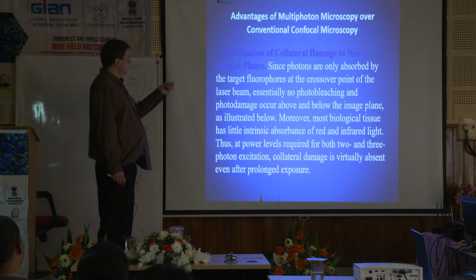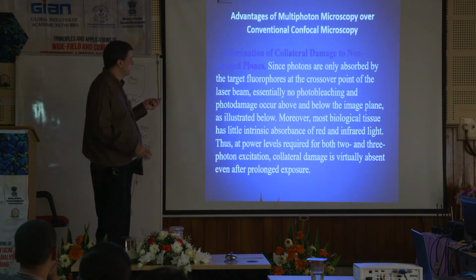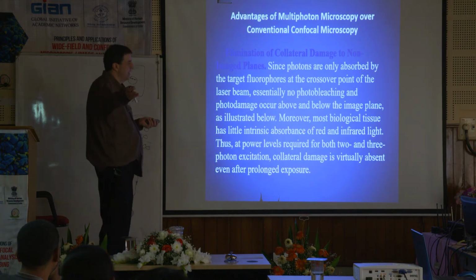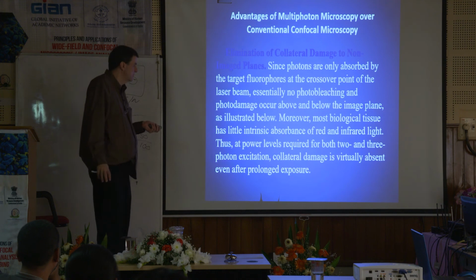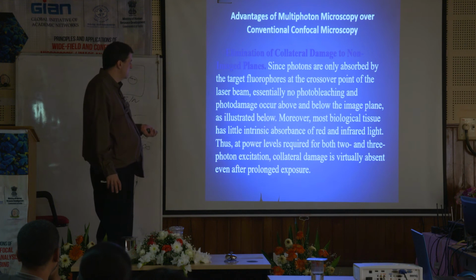Again, the elimination of damage to non-image planes. You're not hurting the areas outside of the plane where you're actually collecting. And basically, most biological tissues don't absorb at those red and infrared lights. Like I was telling you yesterday about autofluorescence, we try to work farther out in the red because you get less autofluorescence, less absorption of fluorescence. So the collateral damage is virtually absent even after prolonged exposure.